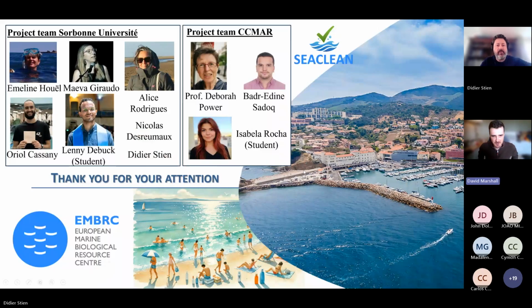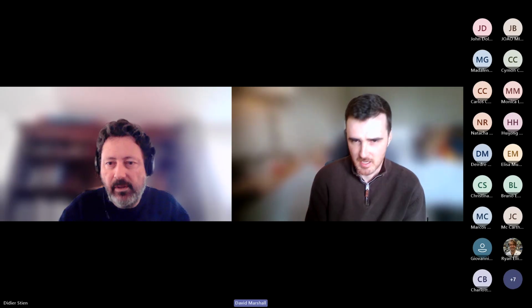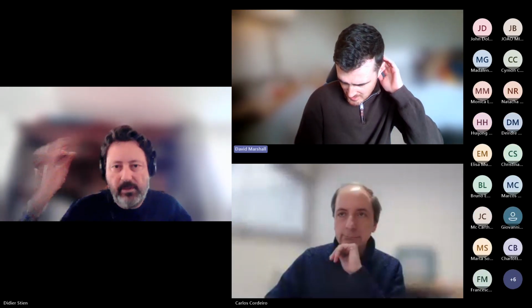Thank you very much, Didier. It's very interesting. If anyone has any questions, as John has mentioned in the chat, please do put them in the chat or the Q&A, and perhaps I can ask a couple of questions at this point. So it sounds like you're essentially developing a database of reference spectra for these pollutants, and I wondered, is there anything that exists currently? Presumably there's a very large diversity of these compounds, so how does your work fit alongside something that already exists, or is this something new?